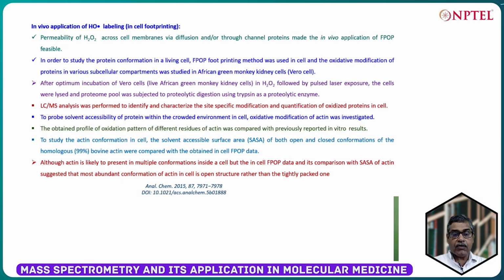So, to probe the solvent accessibility of protein within a crowded environment inside the cell, oxidative modification of actin was investigated. Now, this in vivo study appeared in Analytical Chemistry 2015, volume 87, page number 7971. This is the starting page.